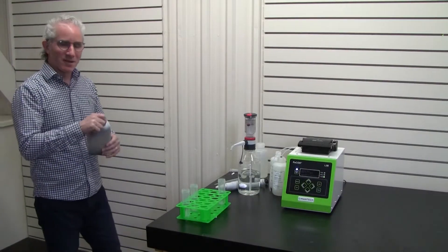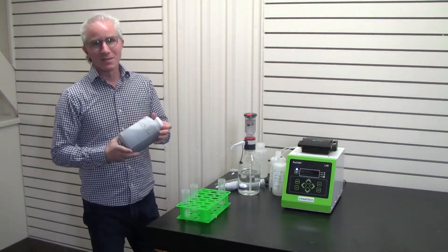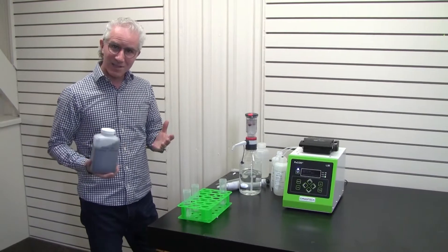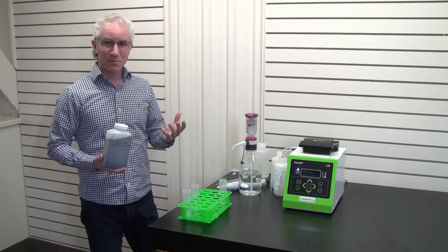Hi there, I'm Robert Mendigato, CEO of ManTech, and here to demonstrate the worst case sample preparation procedure for PeCOD and to illustrate how simple it is.